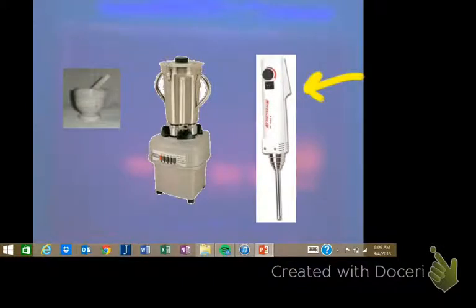What do you suppose a sonicator uses? Sound waves. And so, essentially it's like shock waves. This one's actually a really thick sonicator, but you can get tips that go all the way down to where they can fit inside a little Eppendorf tube. What it does is it vibrates, because sound waves are just vibrations, at such high frequencies that it literally will cause the cells to burst open.